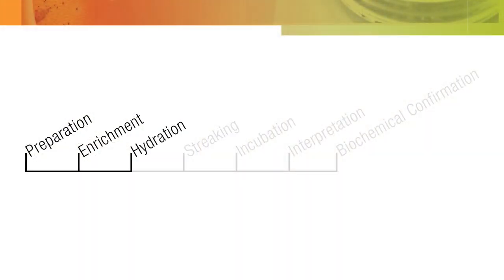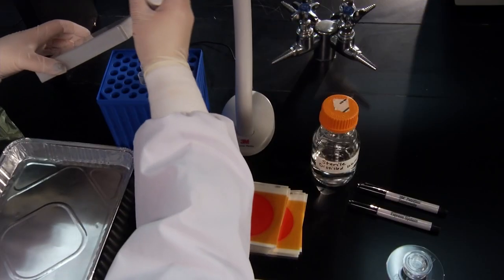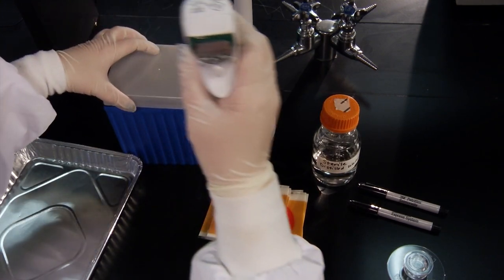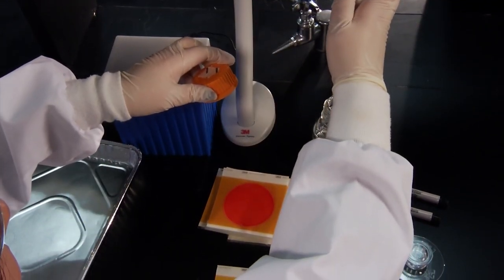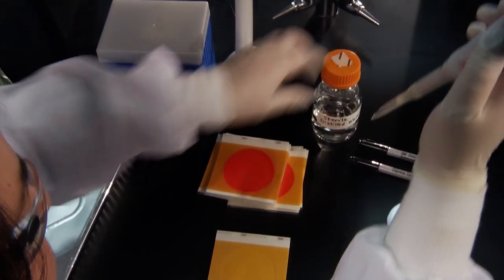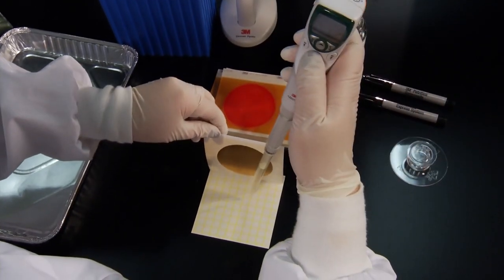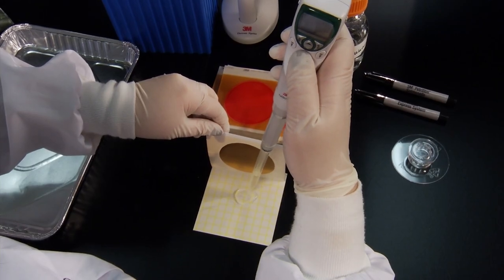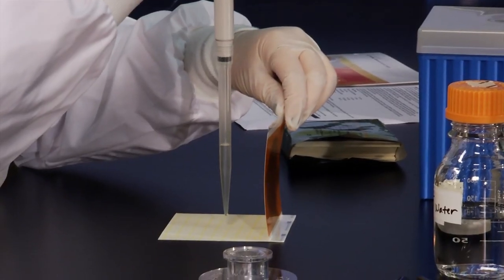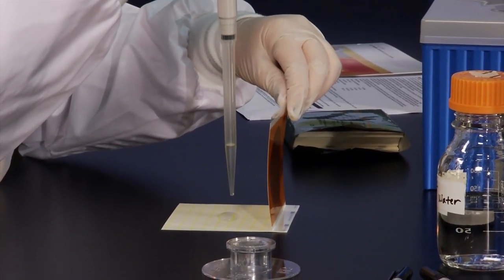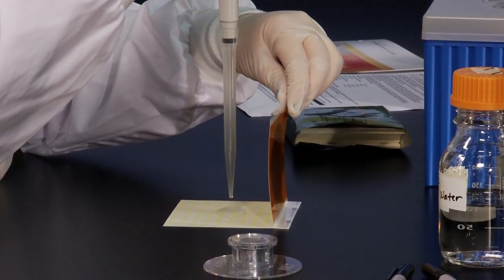The next step is the hydration procedure. To hydrate the 3M PetriFilm Salmonella Express Plate, place the plate on a flat level surface. Lift the top film and with the pipette held vertically, dispense 2.0 milliliters of the prescribed sterile diluent onto the center of the bottom film. Do not close the top film before dispensing the entire 2.0 milliliter volume.